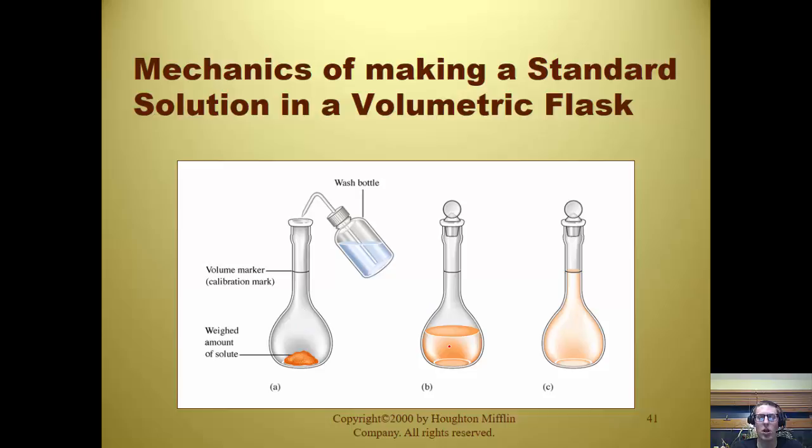You're going to want to do it slowly. Make sure that the meniscus hits just this exact level, because if you add too much to this, then it is too dilute and you do not actually have the concentration that you want it to be.